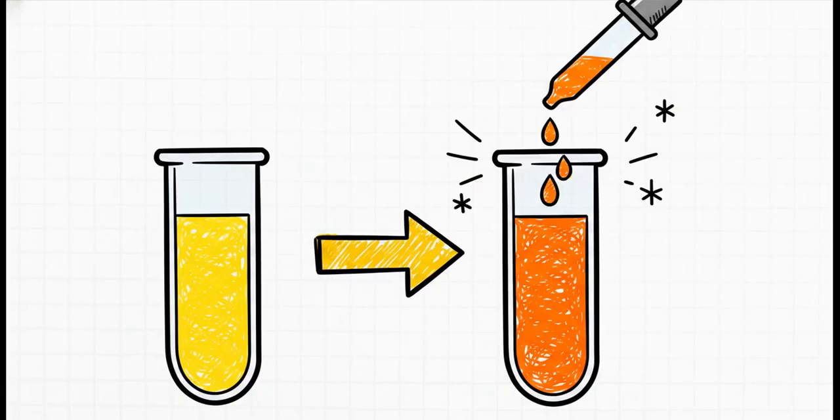The reward for following those steps so carefully is a brilliant double color shift. During that initial heated reaction, the solution turns a distinct yellow. But when you add the alkali in the final step, it creates a salt of the nitro compound, making that yellow morph into a really vibrant orange. That exact shift, yellow turning to orange, is your definitive, undeniable proof that aromatic amino acids are present.